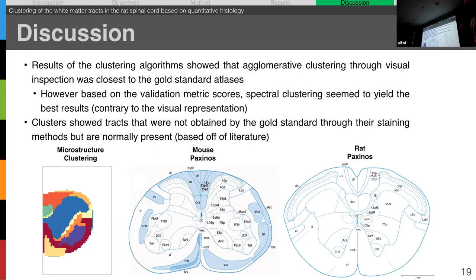So this one isn't specifically. There are two iterations of the segmentation tool that we had. There's a newer iteration, AxonDeepSeg, which is actually more of a machine learning based approach.